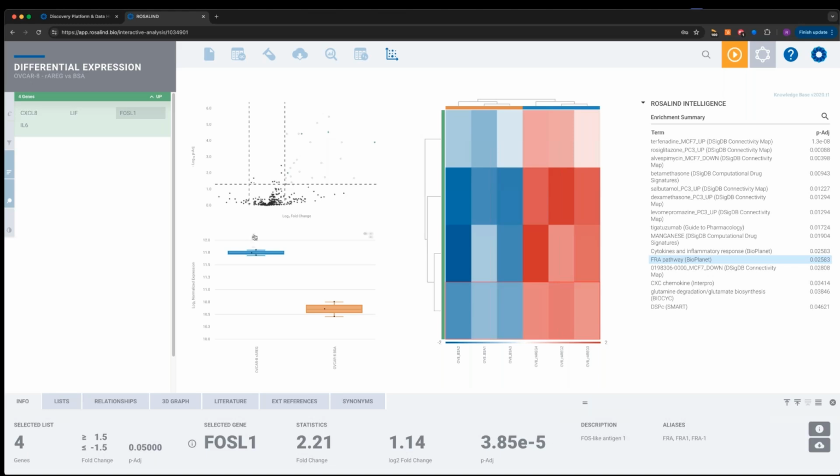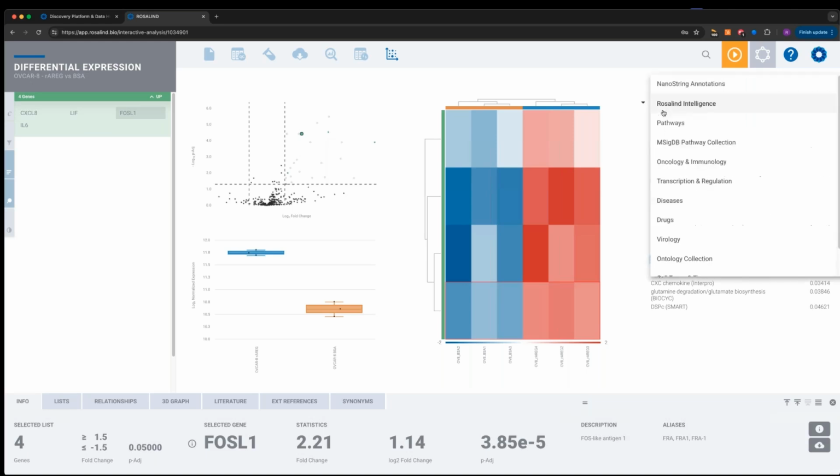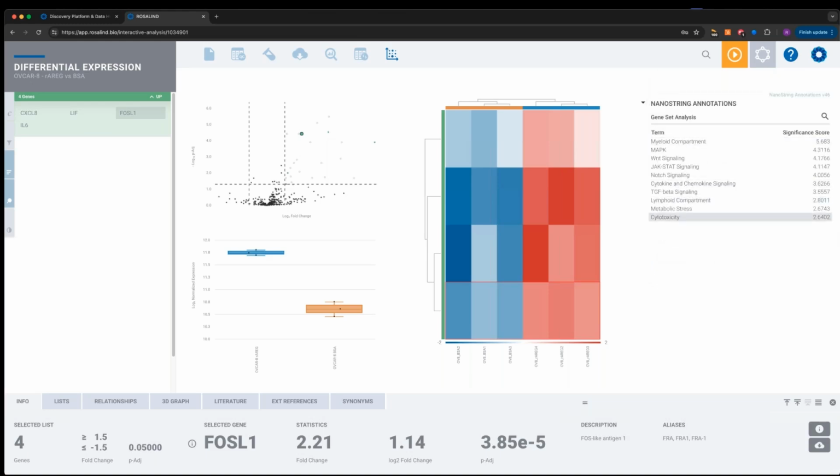Yeah, okay, I understand. So the test statistic is not directly shown as an output in typical analysis packages. It's not found in NSolver. It's not really found in Rosalind as well. So the test statistic is not visible. What is visible, of course, for your genes is the p-values. But the test statistic is just something that's calculated transiently on the way to generate the p-values. But they are used in calculation of the Rosalind NanoString scores here as well. So hopefully that gives visibility.